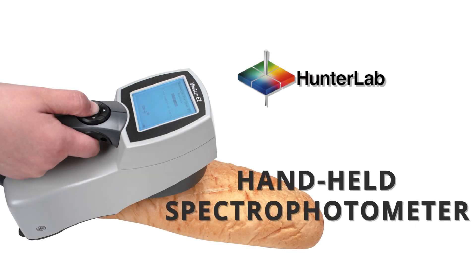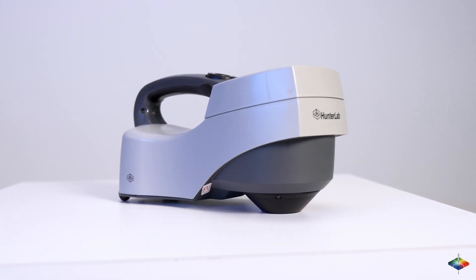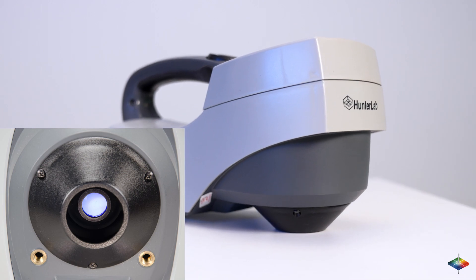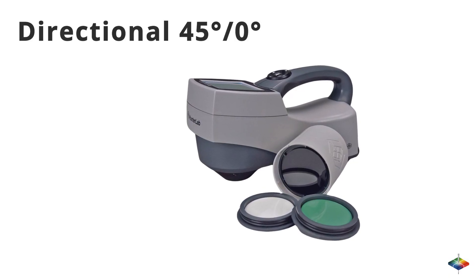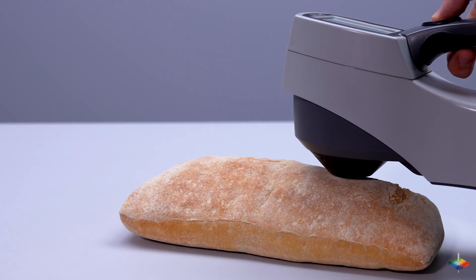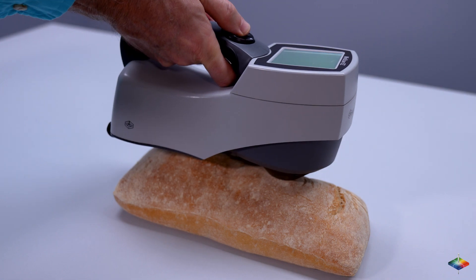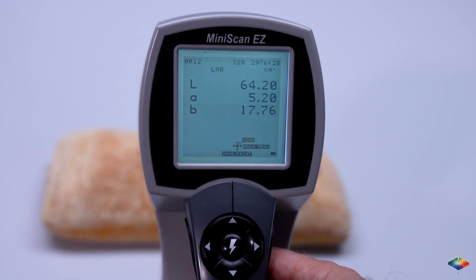Hunter Lab Mini-Scan EZ is a handheld spectrophotometer with a large area of view, available in directional 45/0 degree geometry and diffuse 8 degree geometry. Simply point the Mini-Scan EZ toward the sample, press the go button, and see the necessary measurements within seconds. It's that easy.